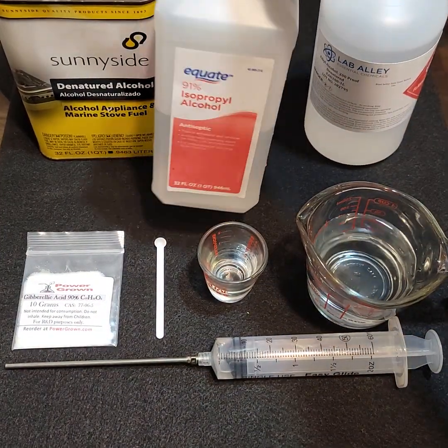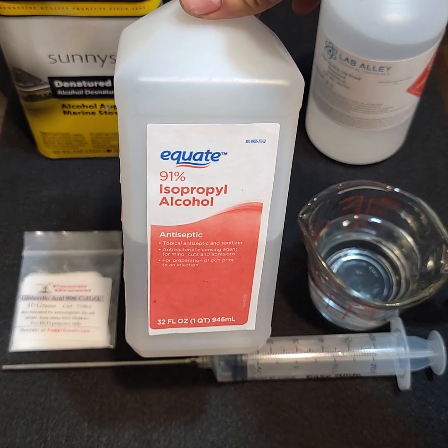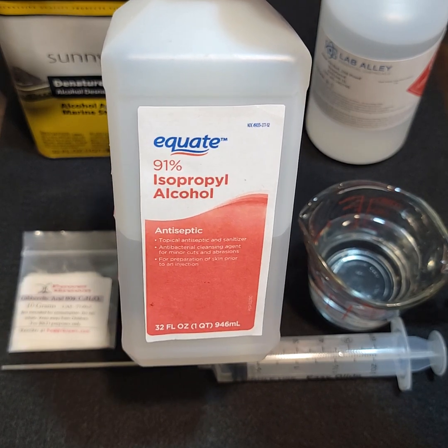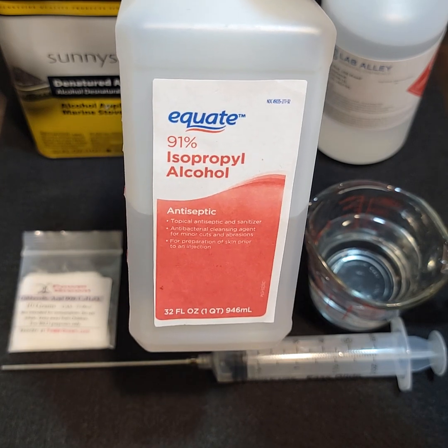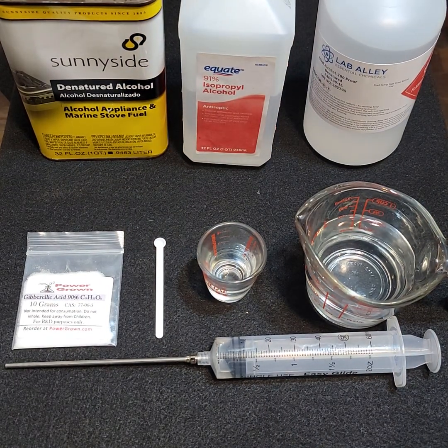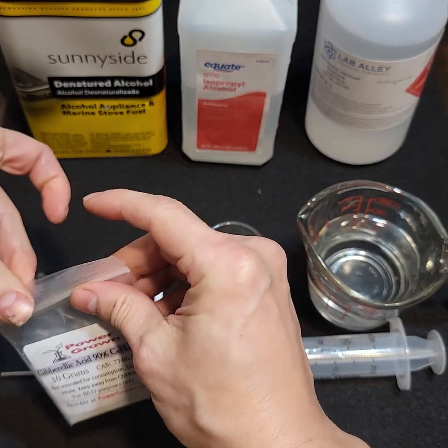I also have rubbing alcohol that I got from Walmart. Rubbing alcohol doesn't work quite as well, but it will work if you can't get the other two — it just requires a little bit more effort. I like to do things easy, so I recommend the ethanol.